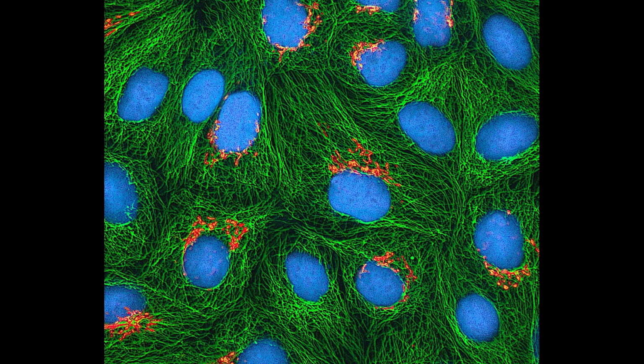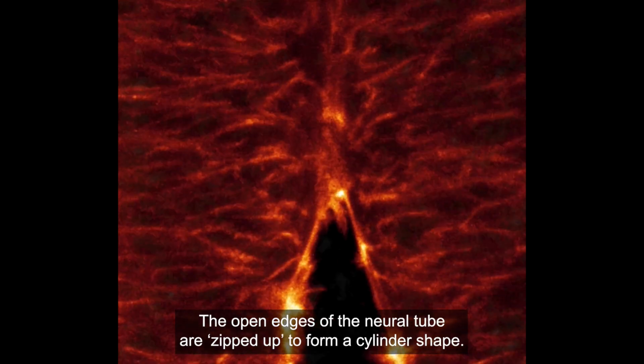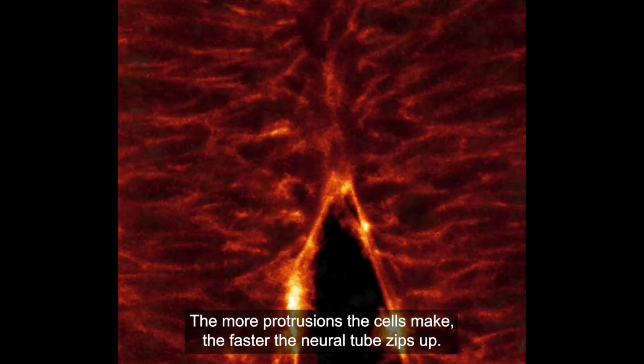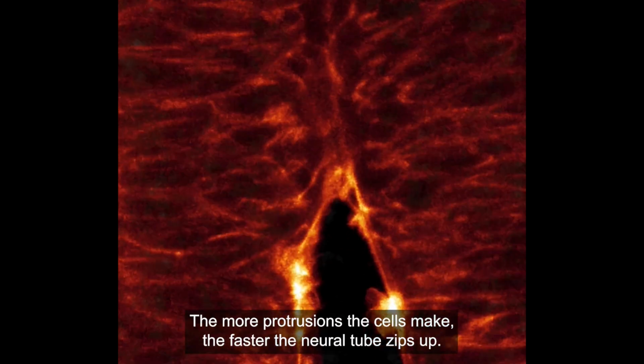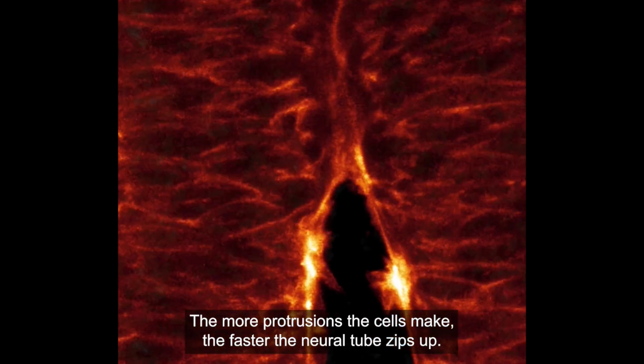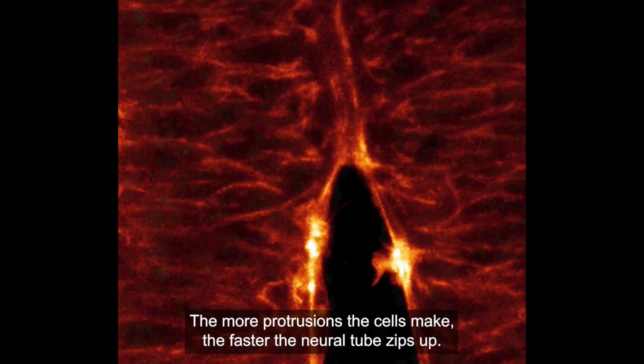Finally, we have proteins. Now, proteins are actually perhaps the easiest and hardest thing to do, and that's for a simple reason. The easy part of it is down to genetics. We have genetic modification technology. This allows us to modify the DNA and allow for proteins to be able to carry the fluorescent protein reporter. That is the fluorescent compound. The challenge is ensuring that the fluorescent compound doesn't get in the way of the protein doing its job.